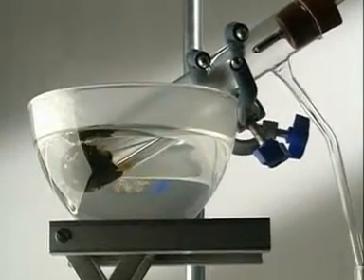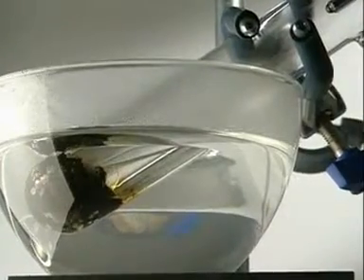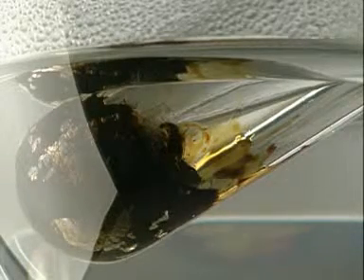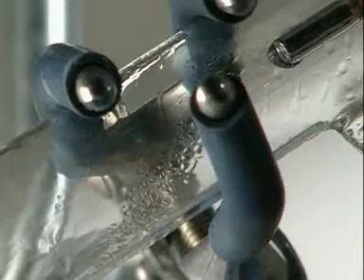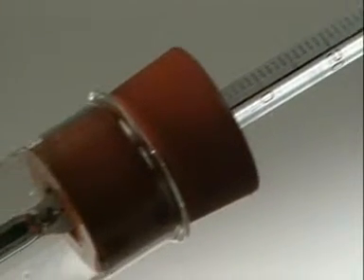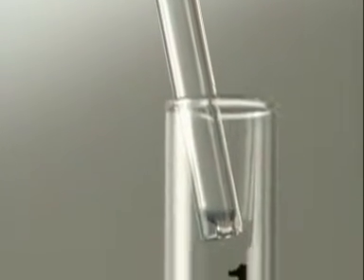The hydrocarbons with lower boiling points begin to vaporize immediately. They're flammable, so it's safer not to heat with a naked flame. As the vapour rises, it enters the sidearm, where it cools and condenses. This happens at about 40 Celsius. The hydrocarbons which boil at this temperature drip down the sidearm and form our first fraction. It's a colourless liquid.